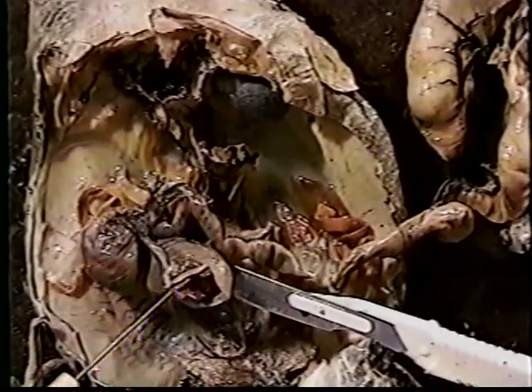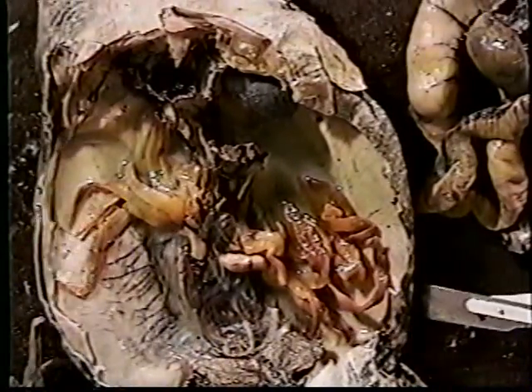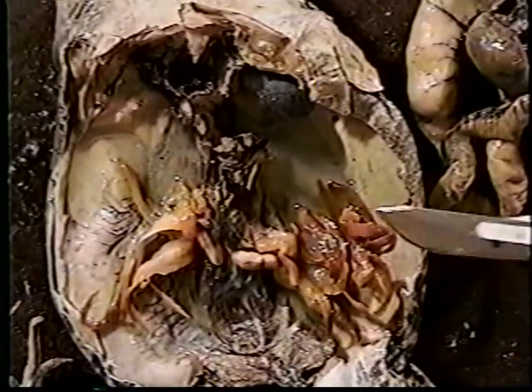I now have removed all of the intestine as well as the stomach. We do have a clear view of what remains in our organism.